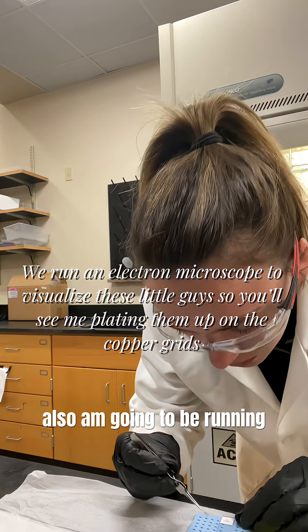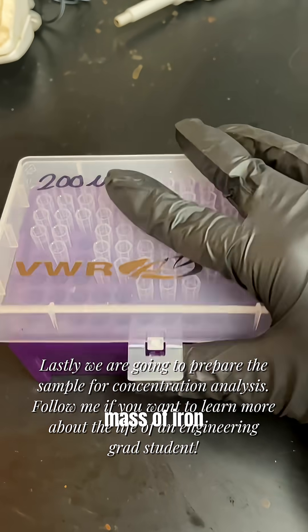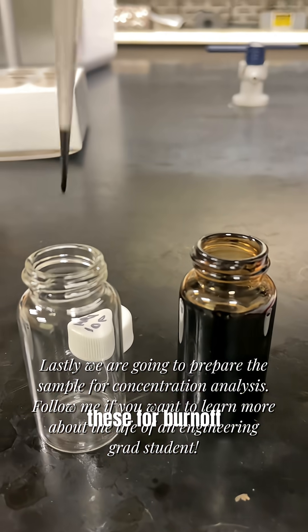Lastly, I also am going to be running concentration analysis. This is important because you need to know the mass of iron in these particles. So I'm going to be preparing these for burn off and digestion.